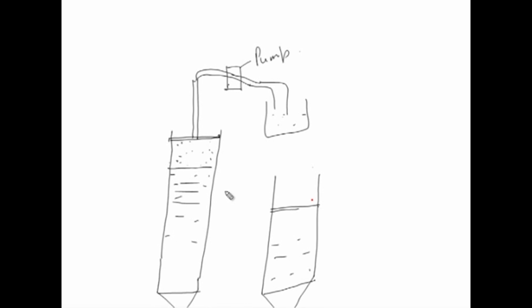Then, very carefully with a micro syringe or a pipette, you can load the sample in a smaller volume, and then very slowly let this sample get into the column. Once it gets into the stationary phase, you can put the mobile phase back, put the plunger on and start the chromatographic procedure.